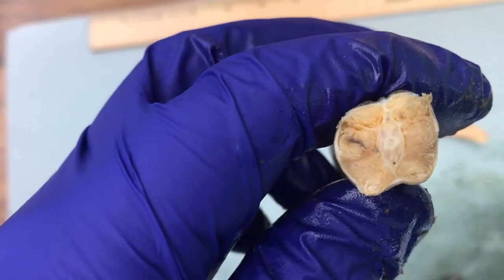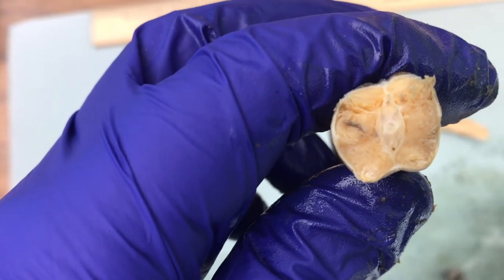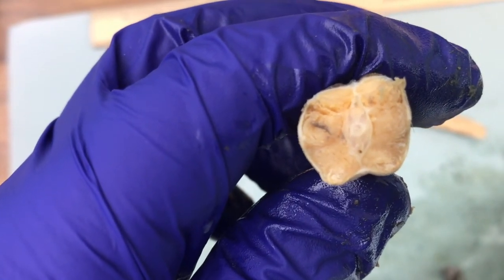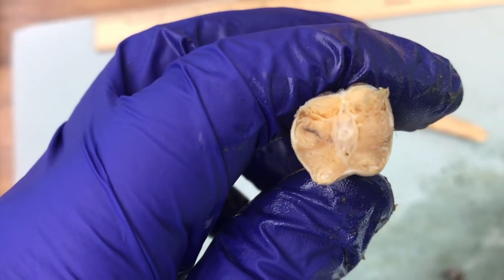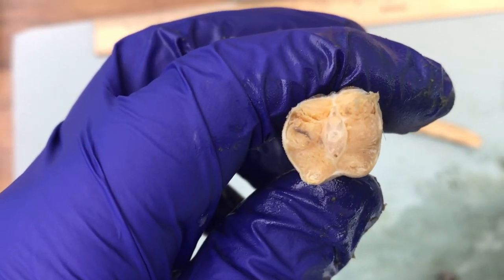Region through the spinal column there and take a look a little bit deeper at that. And of course you can see the muscle tissue on the edge, but what I'm looking at is just that center, but we're going to need a little bit of magnification to see that better.